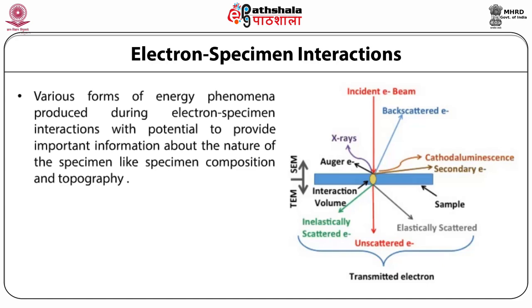These various forms of energy phenomena produced during the electron-specimen interaction have the potential to provide important information about the nature of the specimen.